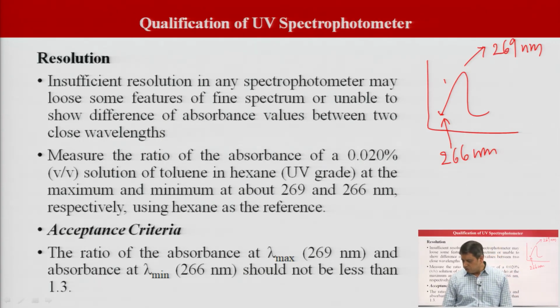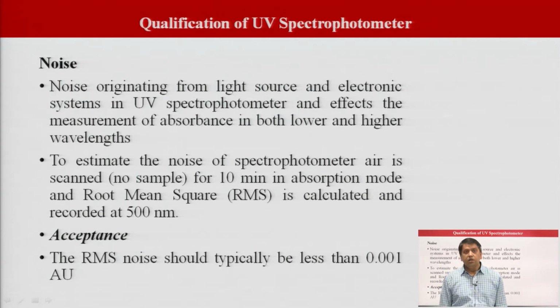So, let us proceed to the next step. The next test is the noise. The noise originating from the light source and the electronic systems in a UV spectrophotometer affects the measurement of the absorbance in both lower as well as higher wavelengths.